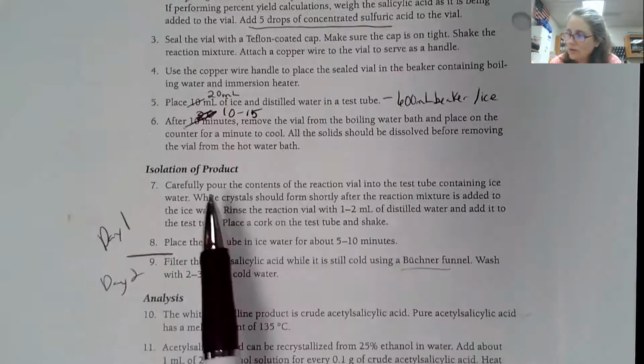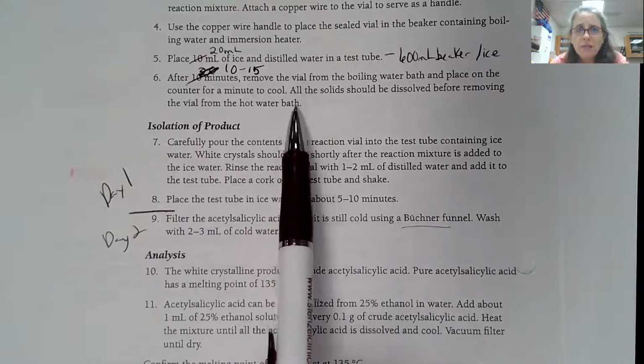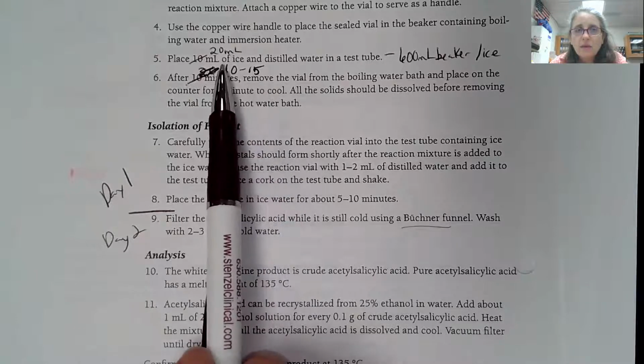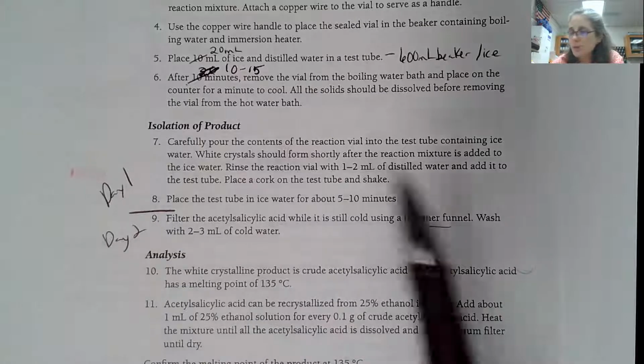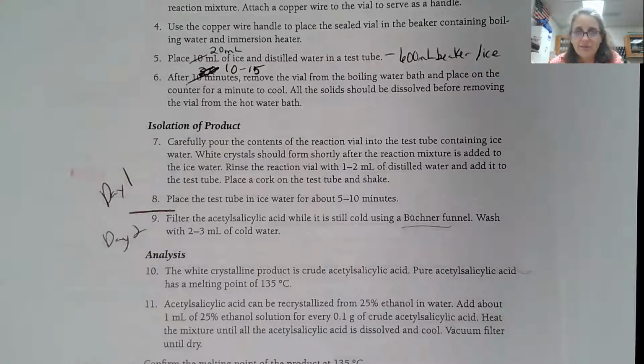Then you are going to essentially what we call isolate the product. So you are going to dump what is in that vial into that large test tube that is filled with distilled water. So literally there's going to be cold water in the test tube, and you're going to dump the vial into it. And then you're going to rinse it a couple times with cold distilled water to make sure you got everything out of the vial.